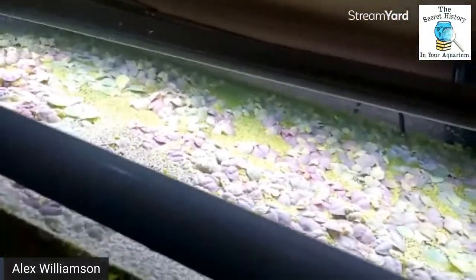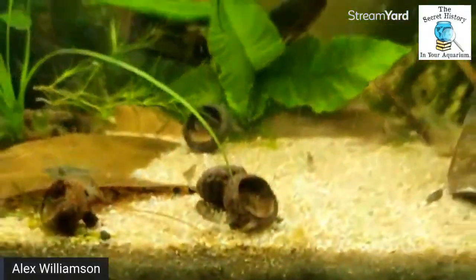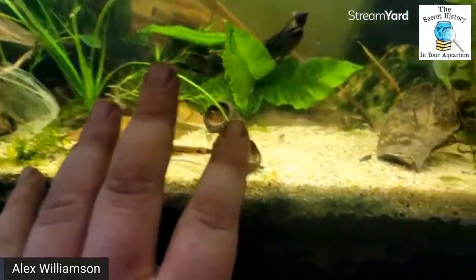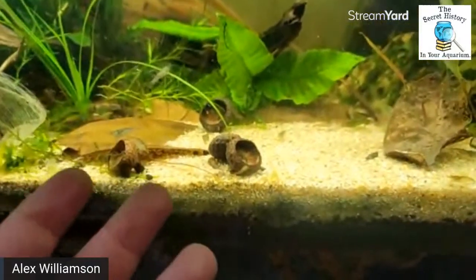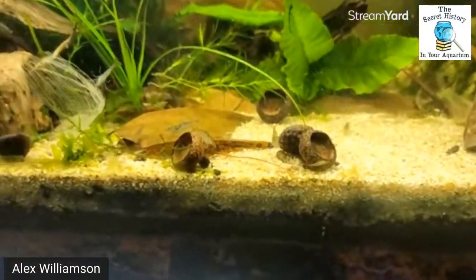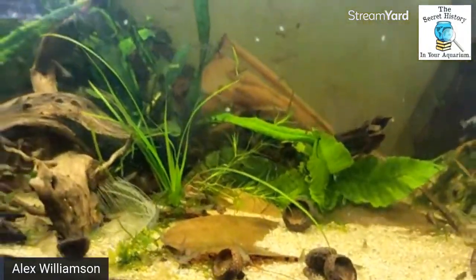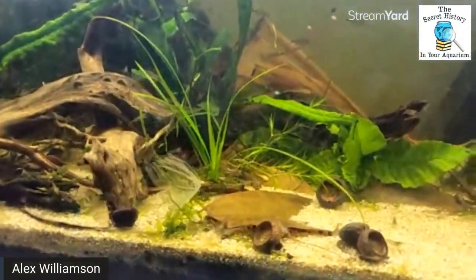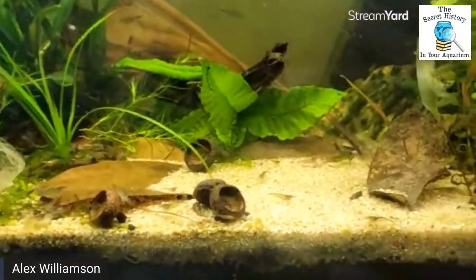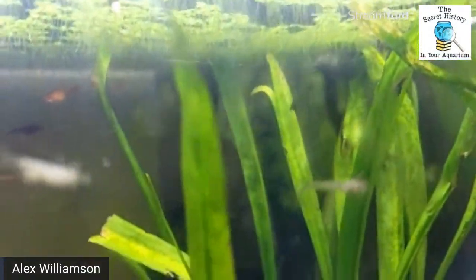And then, for good measure, after we do that one, why don't we also take a look at the tannic and or most acidic tank to contrast how sterile those can be. I just happen to know, usually from experience, these tanks tend to have the least amount of life forms because of the acidity. Now, they'll have algae and particles, but they may not have life forms.